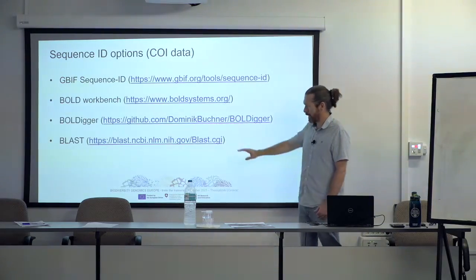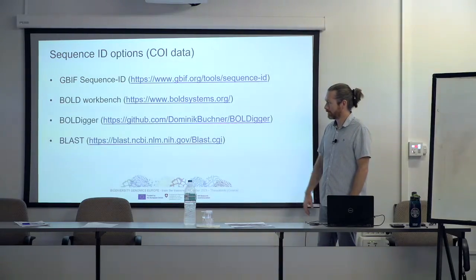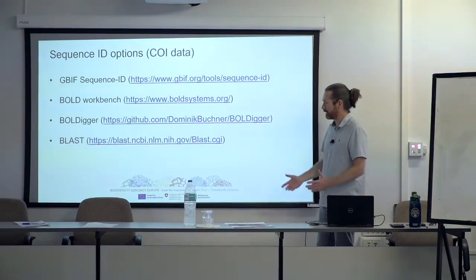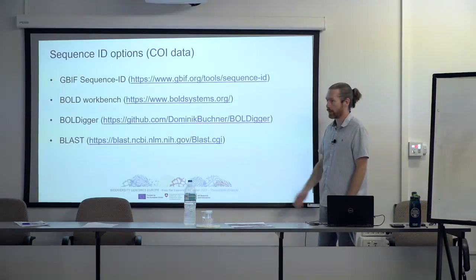And then there's Blast. I'm not going to talk about Blast today. You just blast your sequences. We can if you really want to, but I think these three cover the vast majority of the things we're doing, at least with CO1 barcoding.